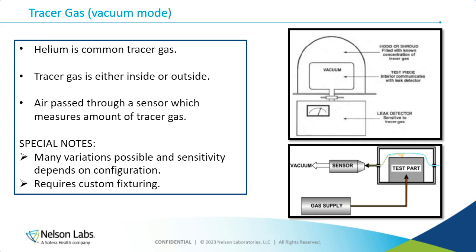And again, you can set these up outside in, inside out. In this example up here, you'll notice that the big difference is the shroud. So now I put my sample in a container. That means that I have a closed system, and that's going to improve my sensitivity, because now I'm not losing random helium molecules out to the atmosphere. So it's a much more controlled space.